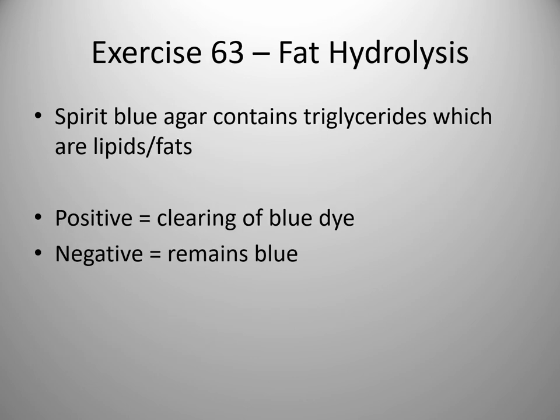Exercise 63 is looking at fat hydrolysis or lipid hydrolysis. This is a spirit blue agar that contains triglycerides in the media. Triglycerides are lipids or fats, so you're looking to see whether the organism can break those lipids down. This has a slightly different result than what is stated in your book in the way we make the media. It is called spirit blue agar, and in this case, a positive test would be if you have clearing of the blue dye. If the entire plate remains blue, that is a negative result.